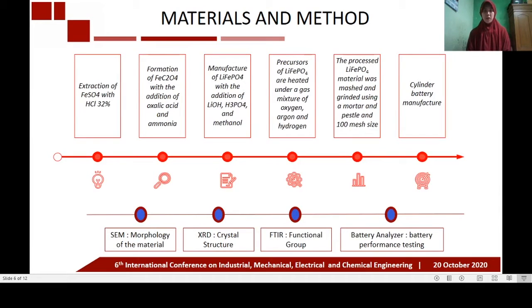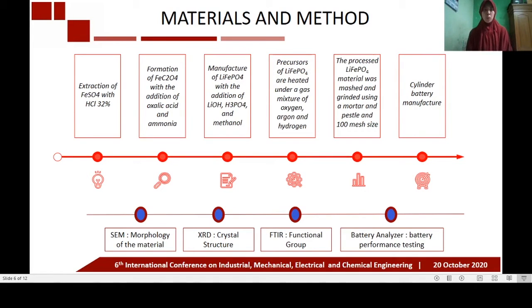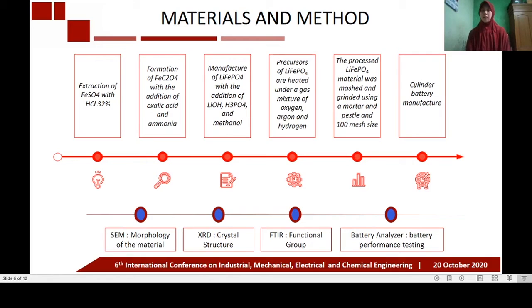For the synthesis of lithium iron phosphate: firstly, extraction of iron sulfate with hydrochloric acid at 32 percent, followed by formation of iron oxalate with addition of oxalic acid and ammonia, then manufacturing of lithium iron phosphate with addition of lithium hydroxide, phosphoric acid, and methanol. The precursor is held under a gas mixture of argon and hydrogen. The processed lithium iron phosphate material is ground using a mortar and pestle through a 100 mesh size. The last step is cylindrical battery manufacturing.